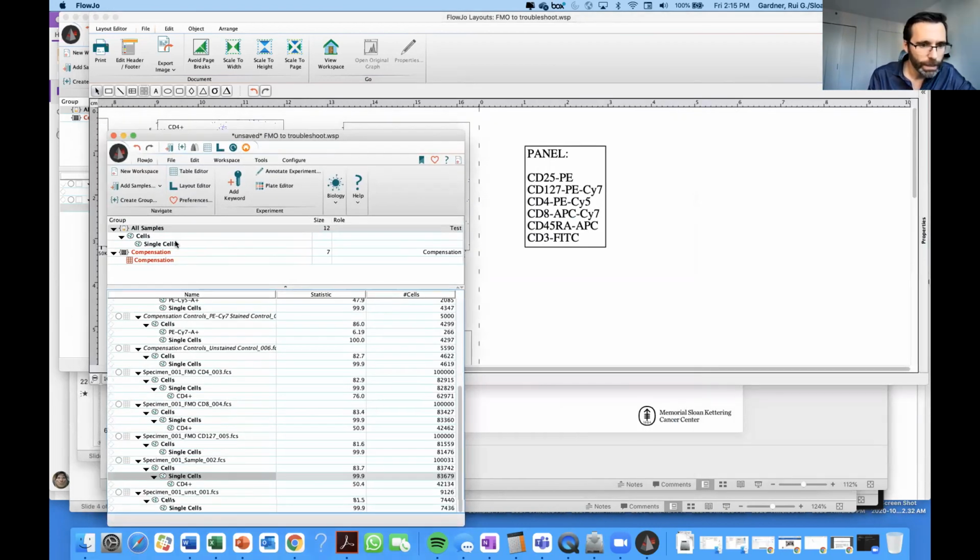the data to compare your single stain controls. In this case, they need to be the same cells that you're using as your sample, and that's why it's important. And here we're talking about when you're still optimizing your panel, by the way. Once you've optimized it, you can reach the conclusion, as Derek was saying, that if you have populations that really resolve, you don't need to have an FMO. That would be pretty obvious. But here we're trying to troubleshoot the panel and optimize it.